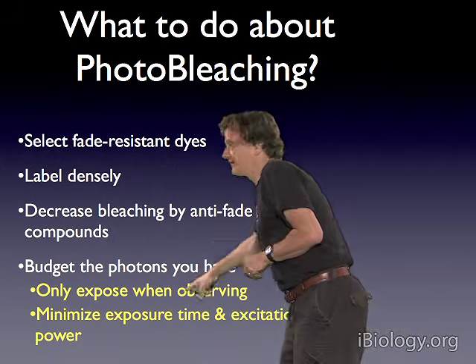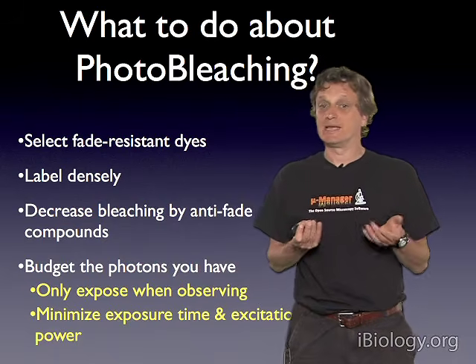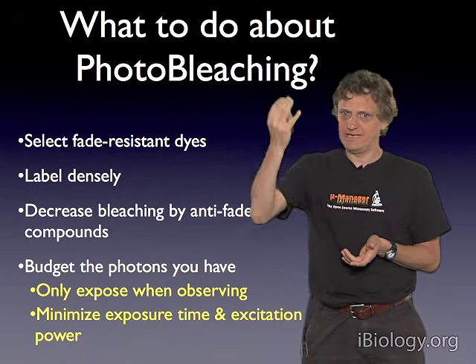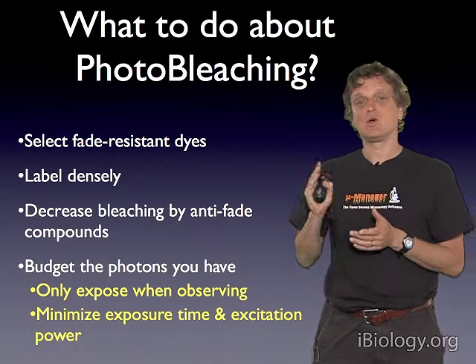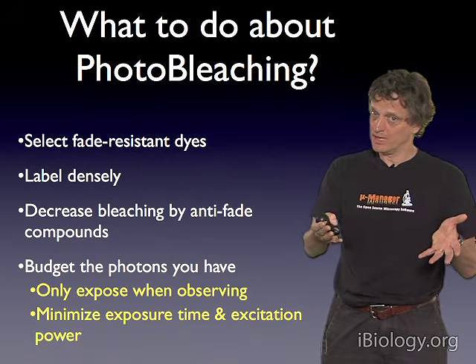And lastly, and very importantly, you really want to use all the photons that you can get out of your dye. So you don't want to leave on that excitation lamp when you're not observing your sample. So always close the shutter immediately when you're not looking.